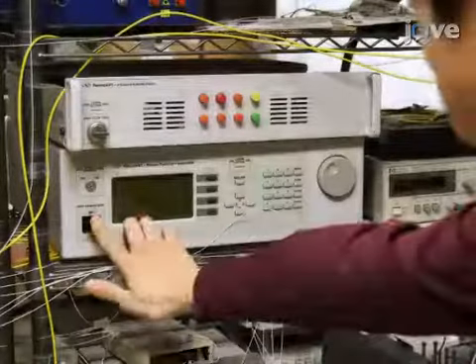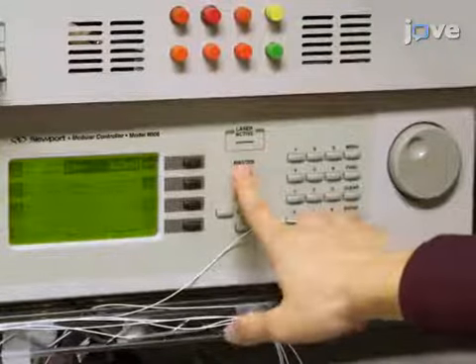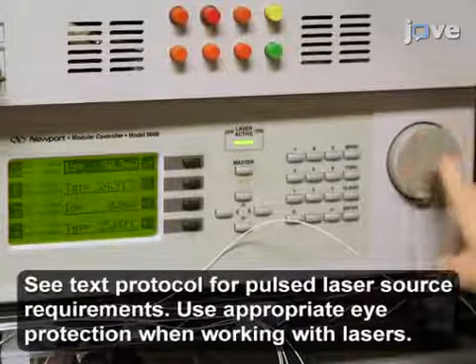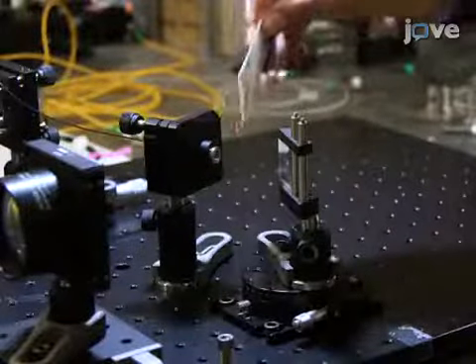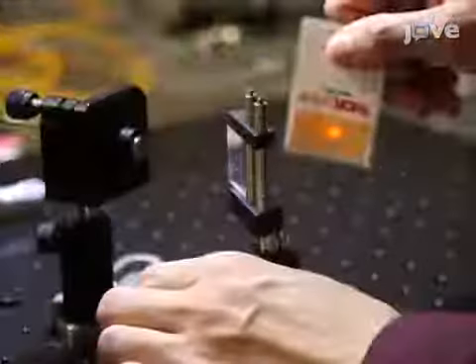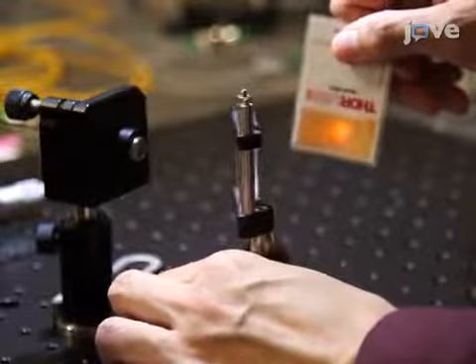To begin setting up the system, use a fiber collimator to couple a broadband femto or picosecond near IR pulsed laser to a single-mode dispersive optical fiber connected to an optical amplifier. Illuminate a transmission diffraction grating with the laser to produce a spectral shower. Orient the grating close to the Littrow configuration to maximize the diffraction efficiency.